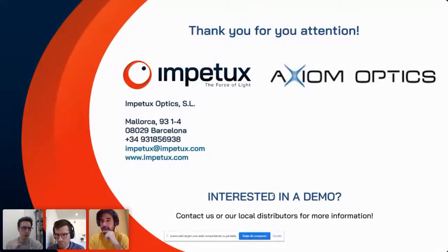And then only when you want to apply the force, you increase the laser power in order to be able to apply that force. The experiments where you need to apply a big force typically are in the range of a few seconds. All the applications that I have shown you are in the range of seconds, right? Of course, if you want to apply a high force for several minutes or an hour, then things get more complicated. But typically, in experiments of cell adhesion or indentation or tether pulling, it's only some seconds. So for the rest of the experiment, you are using low powers to manipulate the sample.